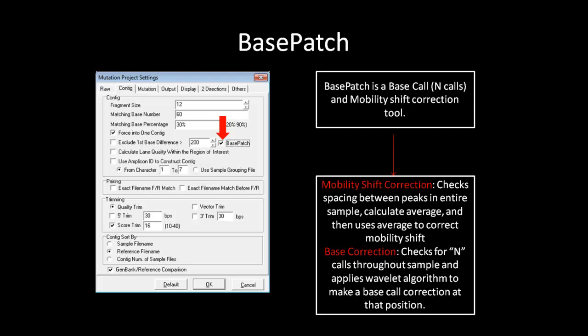It will also look at N calls in the sample and apply a wavelet algorithm to make a base call correction. By correcting for mobility shift and base call issues, it is possible to allow for better alignment and mutation detection in some samples.